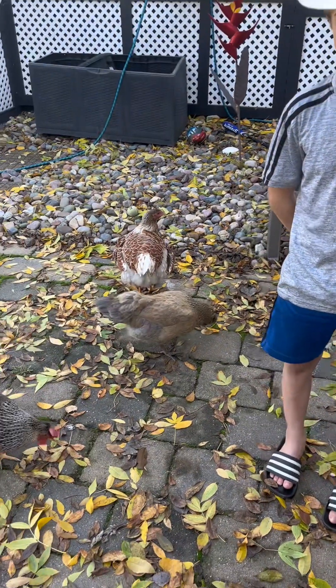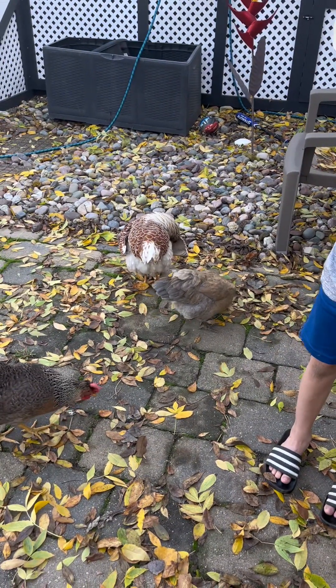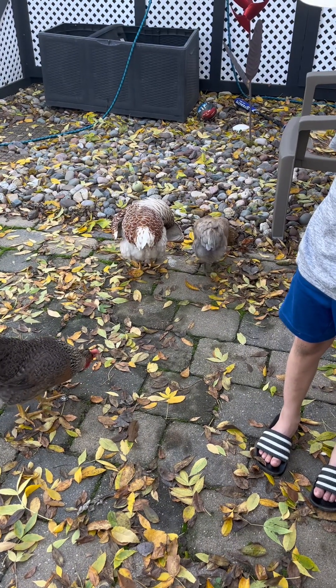We recommend that you get multiple poop samples from the chickens — you can also do this on your dog or cat. Just make sure you have a fresh sample.